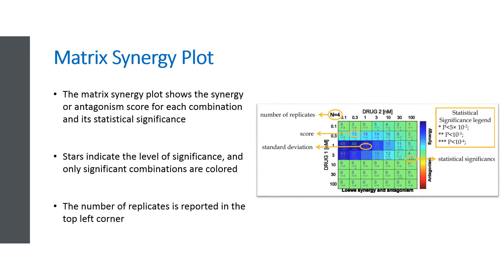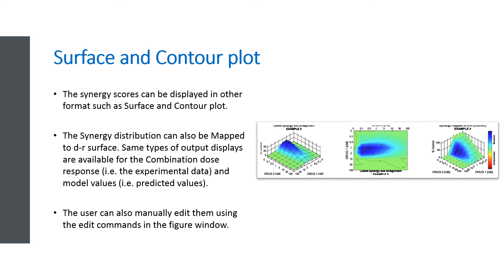Under the Results subfolder, you can also access the Matrix Synergy plot. The Matrix Synergy plot shows the Synergy or Antagonism score for each combination and its statistical significance if the Test Significance option was selected. Stars indicate the level of significance and only significant combinations are colored. If the Test Significance option was not selected or only one replicate was available, no stars are displayed and all cells are colored. The number of replicates is reported in the top left corner. The Synergy scores can be displayed in other formats, such as the Surface and Contour plot. The Synergy distribution can also be mapped to the DR Surface. When plots are displayed by ComBenefit, the user can also manually edit them, such as changing the orientation of the 3D surface, zoom in or out, highlight specific values, using the edit commands in the figure window.